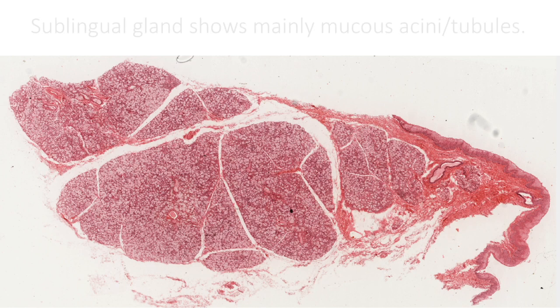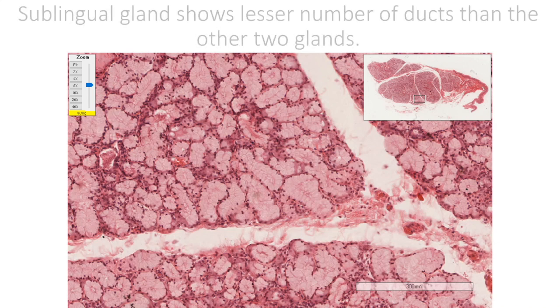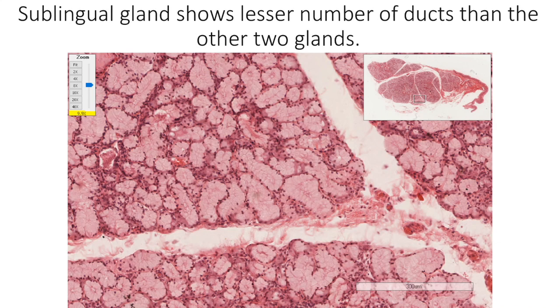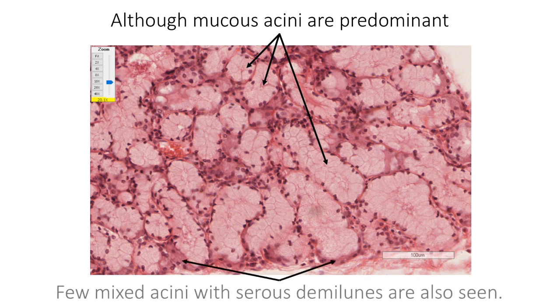The sublingual gland shows mainly mucous acini or tubules. Compared to the other two glands, the sublingual gland shows a lesser number of ducts. Although mucous acini are predominant, few mixed acini with serous demilunes are also seen.